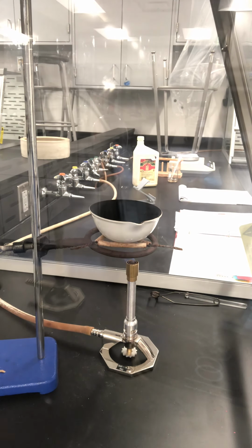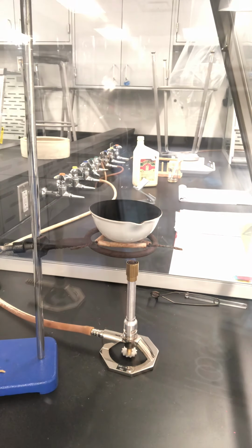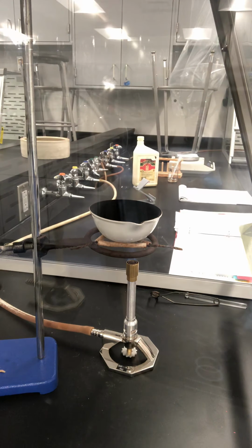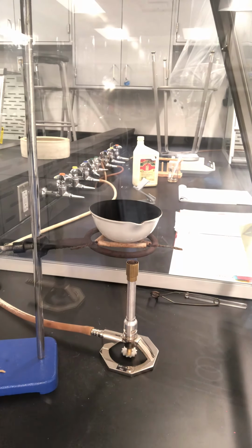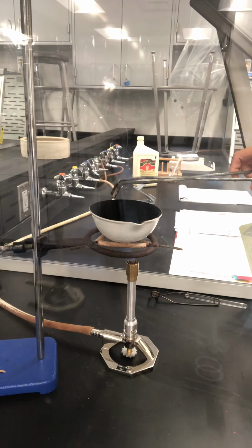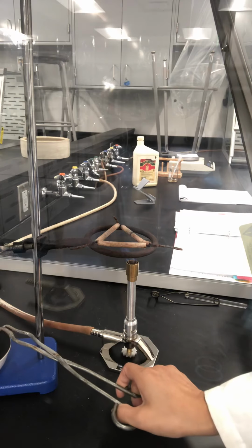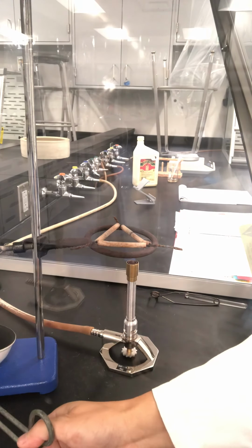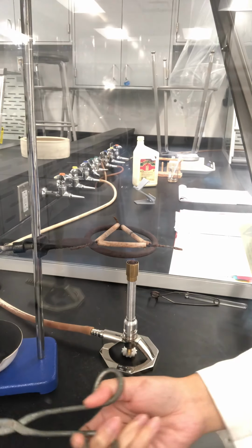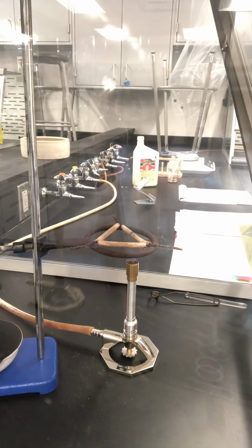As we can see now, the white fume is almost gone. After the white fume is gone, I will remove this from the flame and put it here and let it cool down to room temperature. And now we are on step 12. After it's completely cooled down, we will come back.